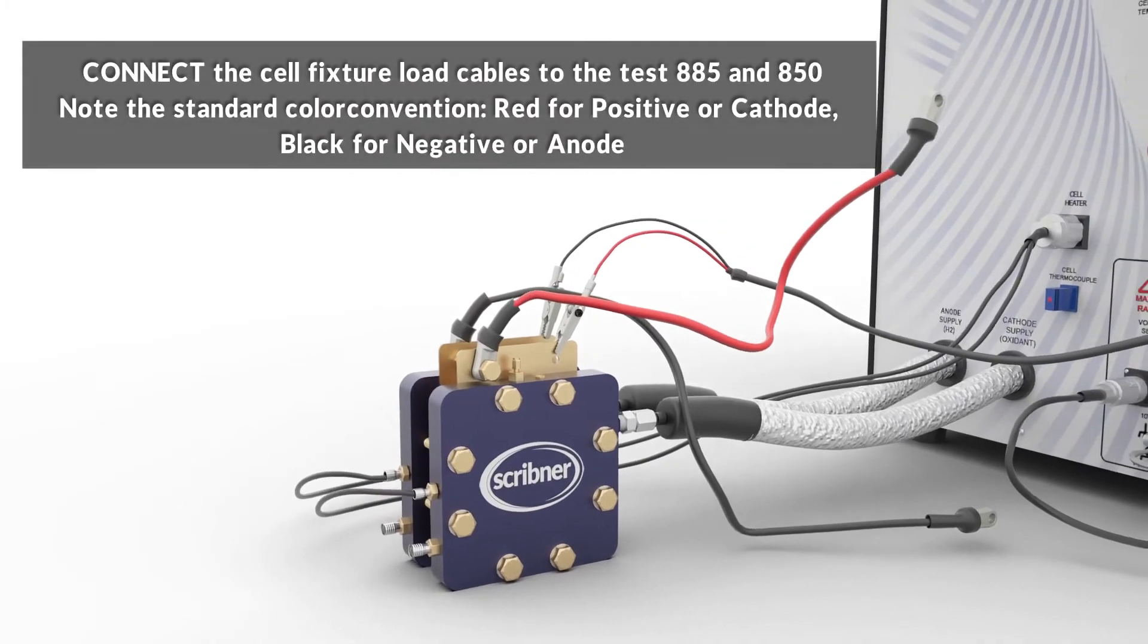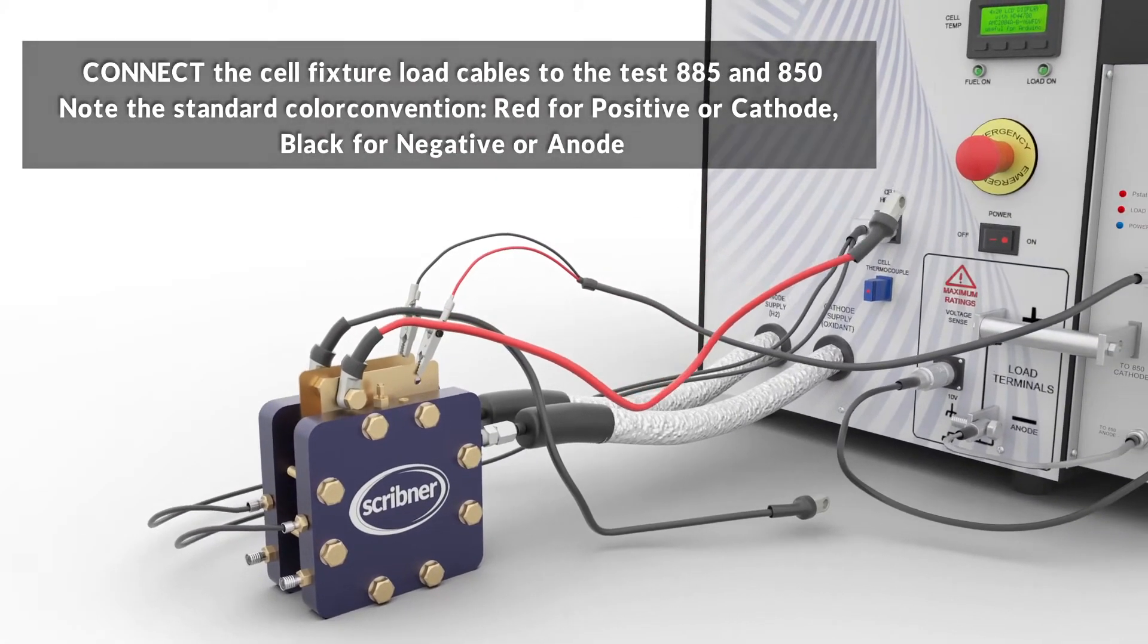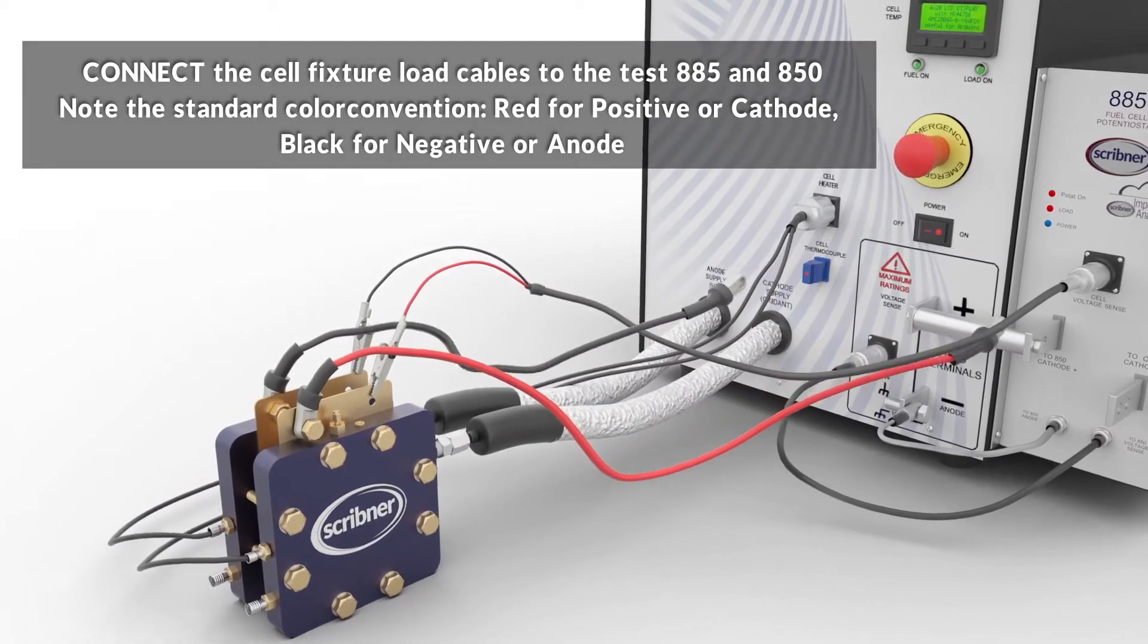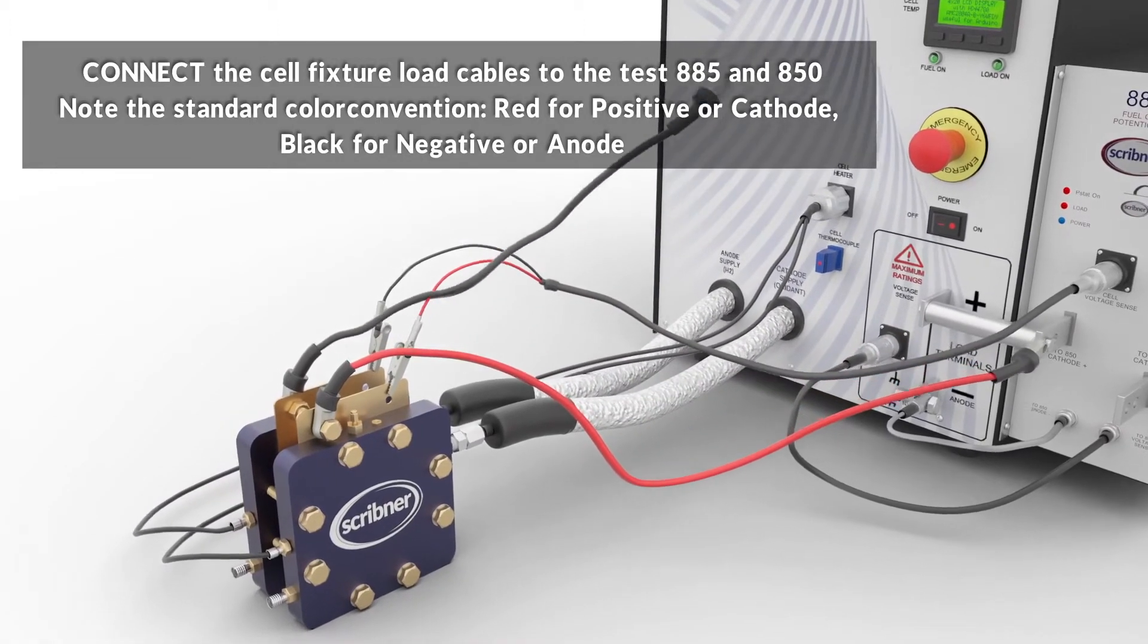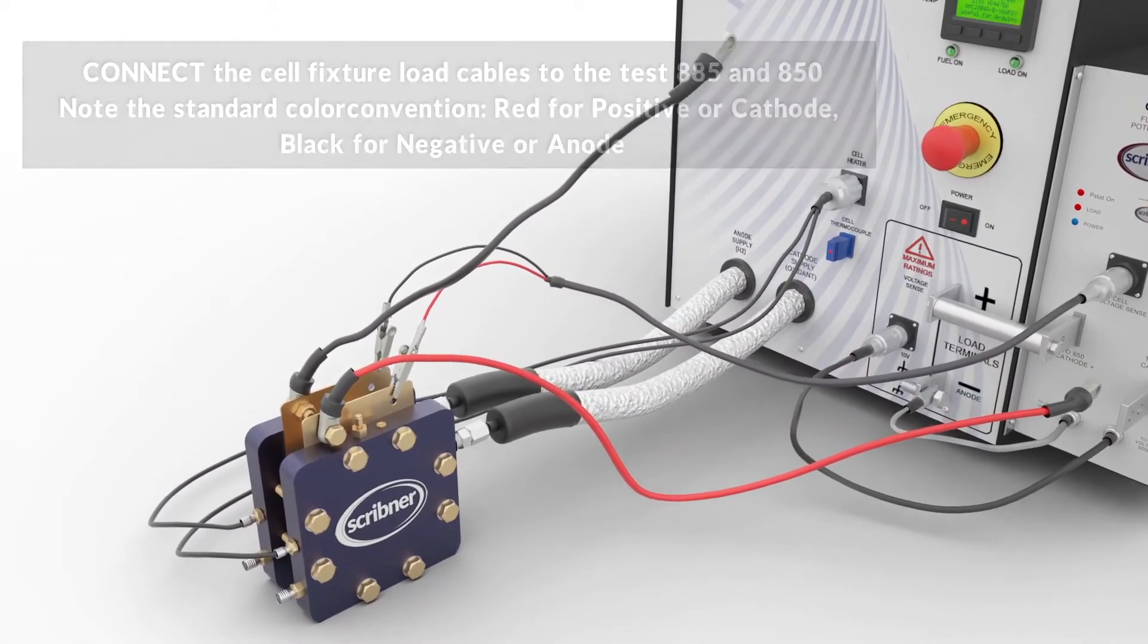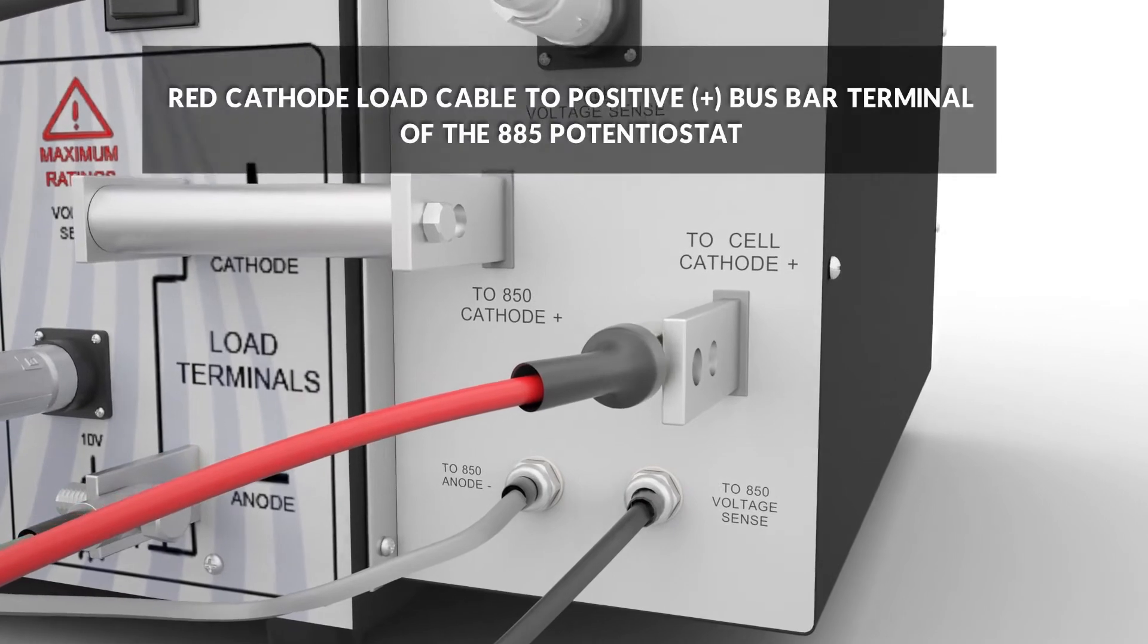Now connect the cell fixture load cables to the test system. Note the standard color convention, red for positive or cathode and black for negative terminal or anode.